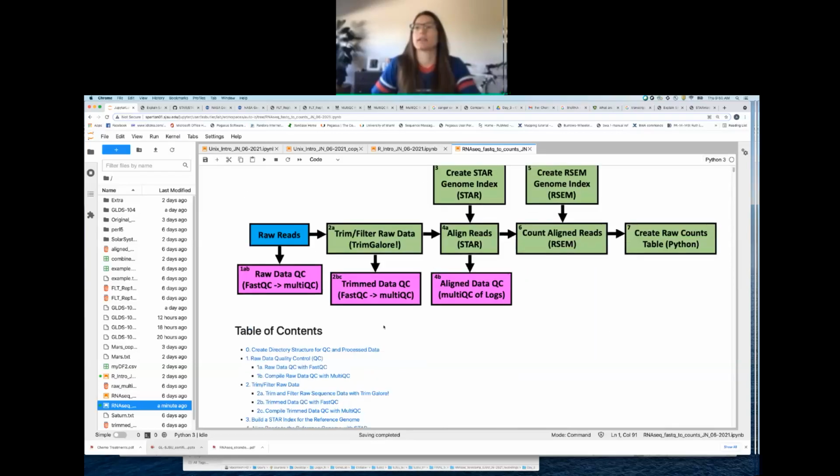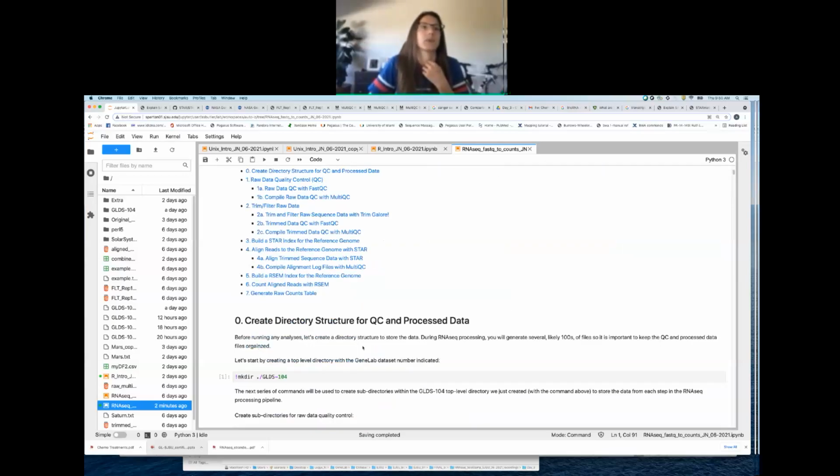Did anyone get something? Is it because we didn't head it? Well, good question for sure. Because I was grepping for that one specific sequence, it should only give me the lines that contain that one sequence. And since we know that it maps to 5 transcripts, if those transcripts each came from a unique gene, then the most lines we would get would be 5, representing the 5 unique genes where that transcript came from. So that's why I didn't include a head there, because the most lines we should have gotten would have been 5.